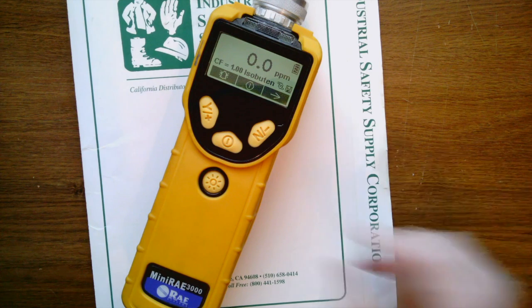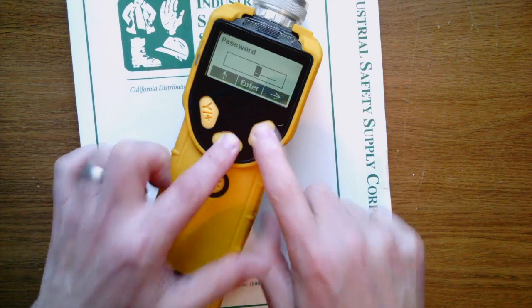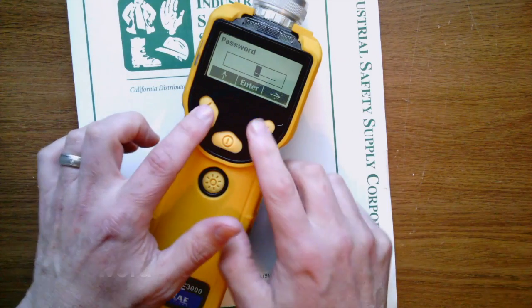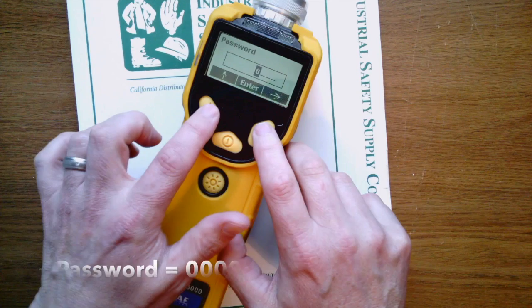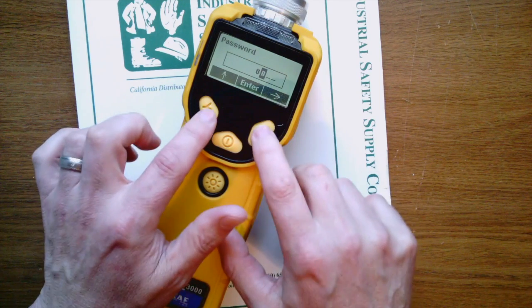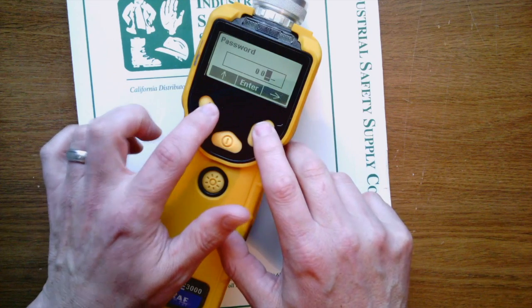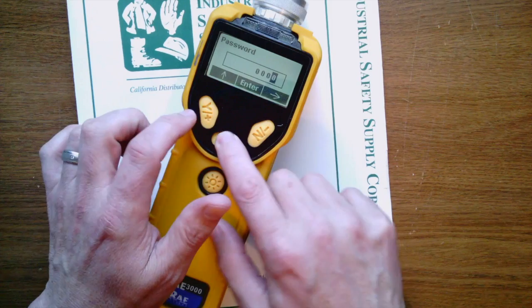So to get into the menu, we're just going to hit the N and mode keys. It's going to prompt us to enter a password, and the password for Ray Systems Instruments is 0000. By utilizing the soft keys that you see here, we're moving the arrow over, giving it a 0, over, 0, and now we're going to enter.